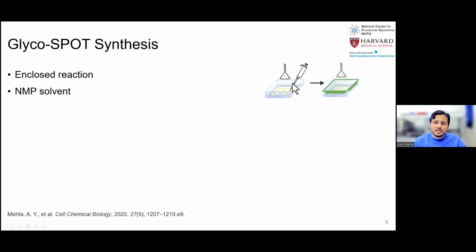And we did the entire chemistry in that, in terms of spotting and all. And at the same time, we had a funnel on top blowing nitrogen over this so that it creates an inert environment. And then as soon as we close it, we can turn off this nitrogen and leave the reaction to go on in this vessel.